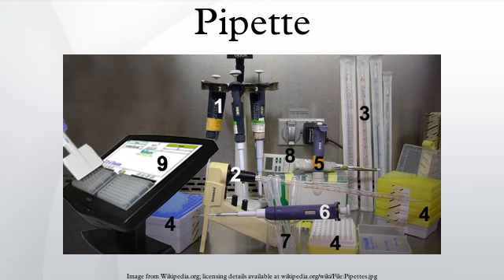Specialized pipettes, pipetting syringe. Pipetting syringes are handheld devices that combine the functions of volumetric pipettes, graduated pipettes, and burettes. They are calibrated to ISO volumetric A-grade standards. A glass or plastic pipette tube is used with a thumb-operated piston and PTFE seal which slides within the pipette in a positive displacement operation.